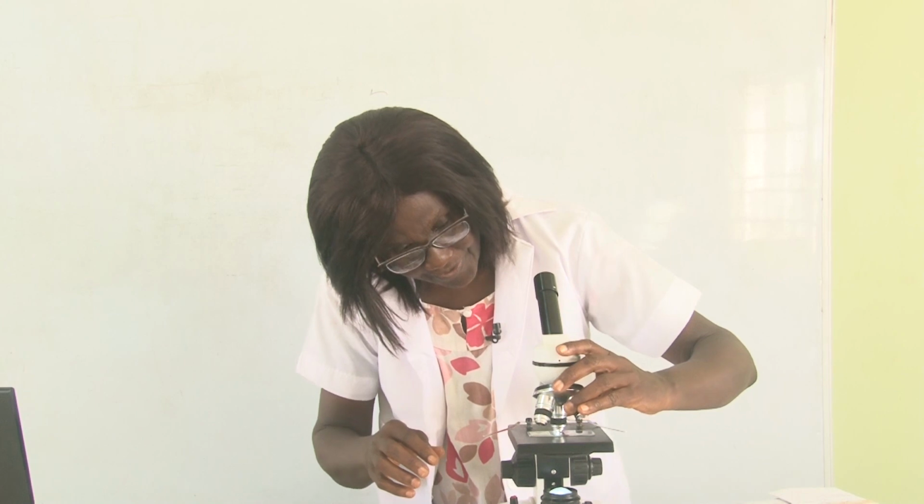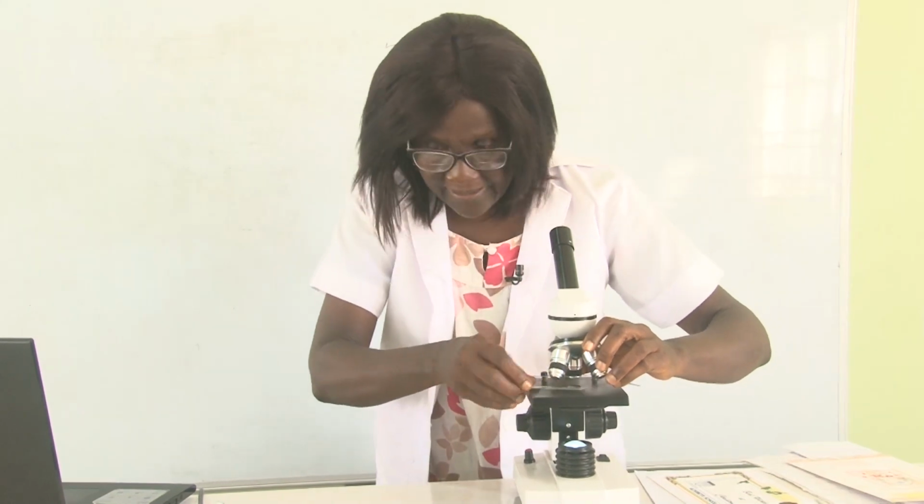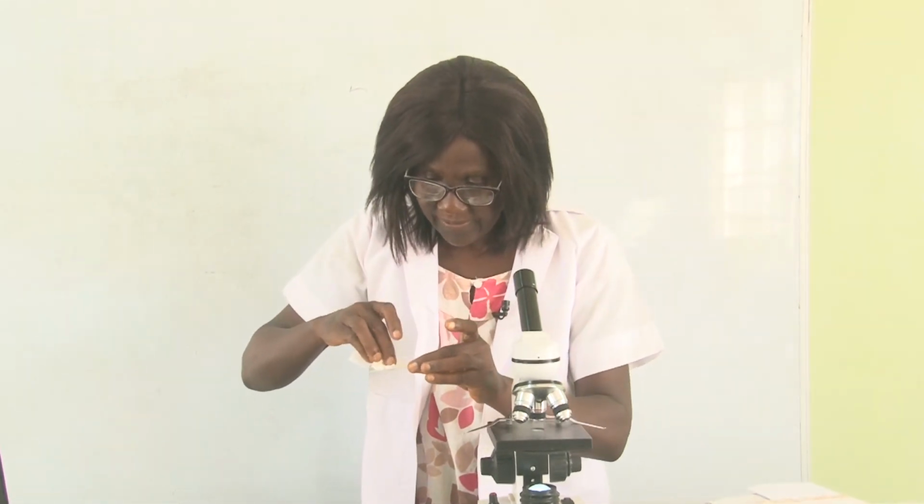Well, you have questions to solve. We are going to take our slide off. Now we clean off our slide with a neat, soft tissue. We clean off the oil from our slide.